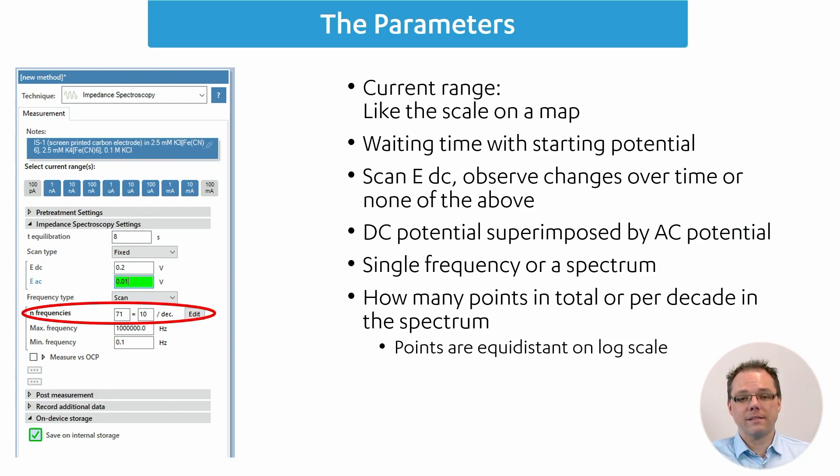Then you have the number of frequencies that you want to set. You can either set in the left field how many points you want in total, or you can set on the right one how many points you want per decade. A decade here means distances that increase by multipliers of ten. So one decade will be from one to ten, then from ten to a hundred, then from a hundred to a thousand.